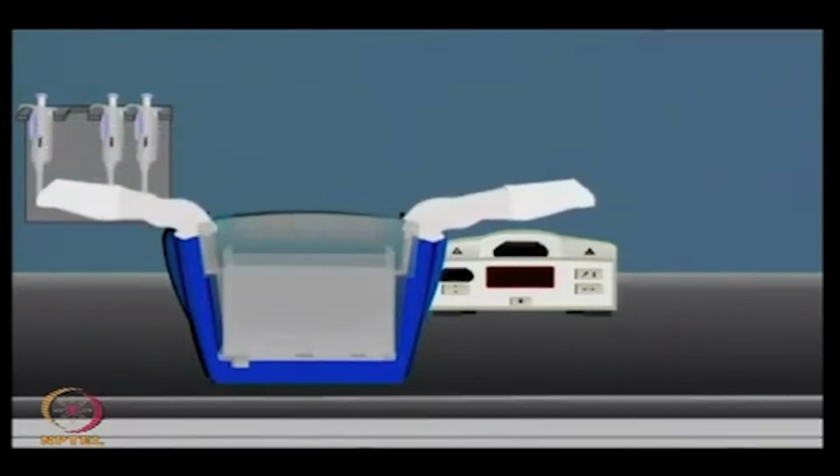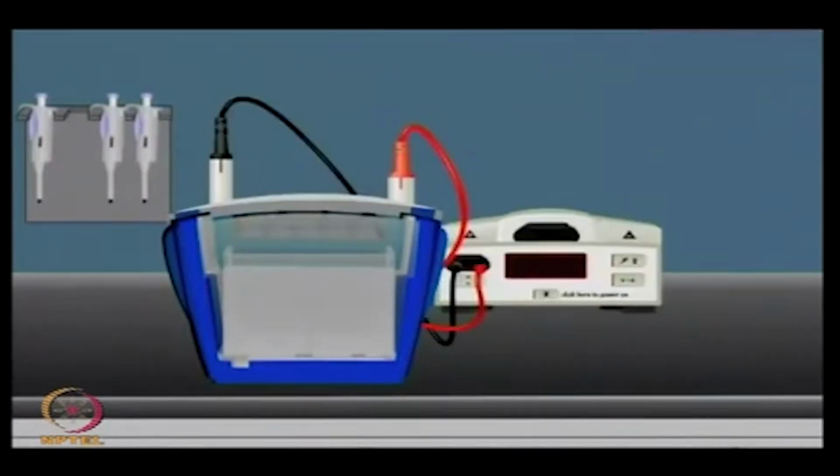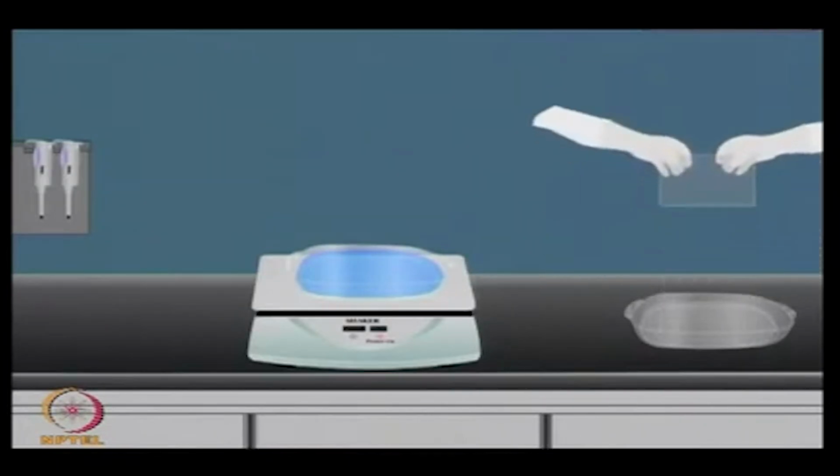Once the gel is polymerized, then you can add the IPG strip, and now ensure that the assembly is properly sealed and buffers are properly placed, so that proteins can be separated based on their molecular weight. Depending on the gel length, you can perform the second dimension separation for a few hours. After second dimension separation is done, then we can perform the staining and de-staining.